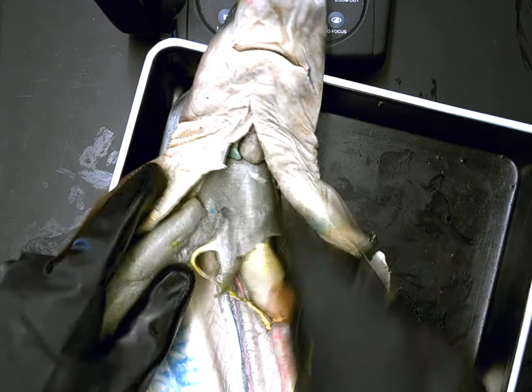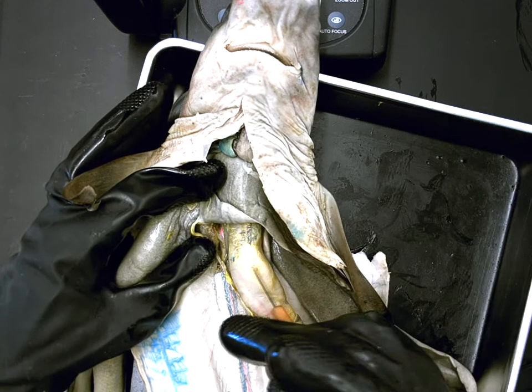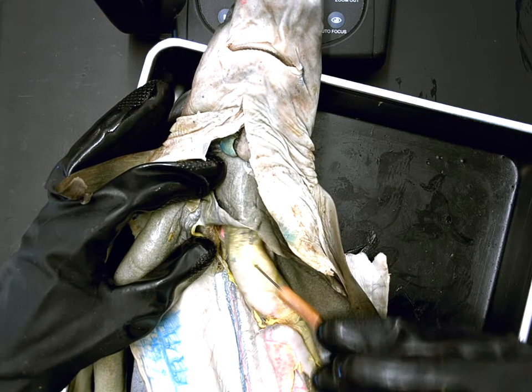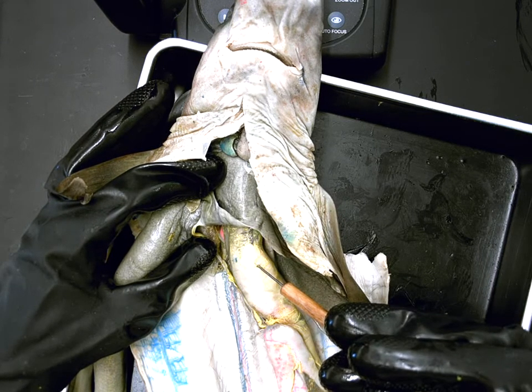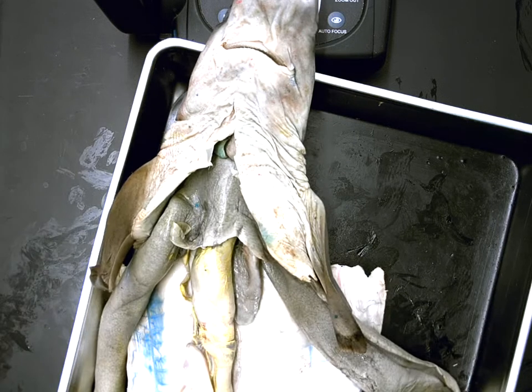Store bile. Correct. If I move the liver to the side, I see that there's this big, huge muscular passageway here. This would be what, Joe? Esophagus. Excellent. Function of esophagus. Push down the food. Correct. Then we can see that there's this lovely, let me turn here.